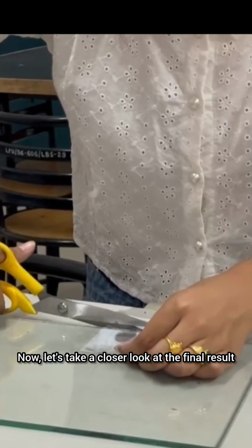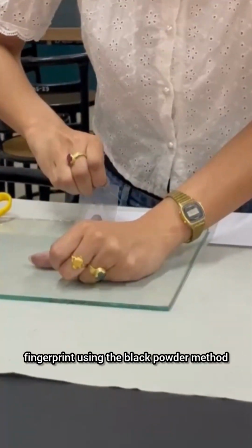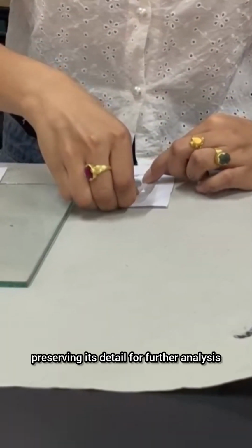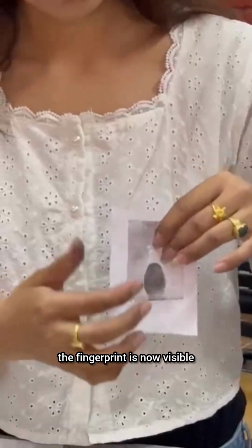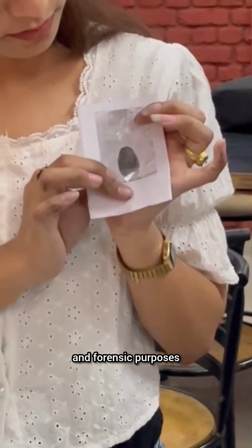Now let's take a closer look at the final result. I have successfully collected the latent fingerprint using the black powder method, followed by lifting. The lifted print has been carefully transferred onto the white paper, preserving its detail for further analysis. As you can see, the fingerprint is now visible, allowing us to examine its unique characteristics. This collected latent fingerprint can be used for identification and forensic purposes.